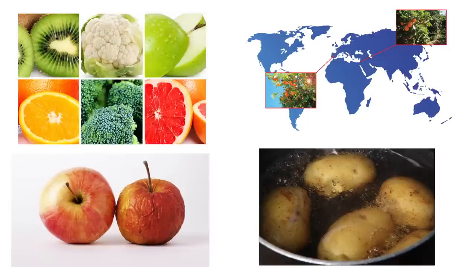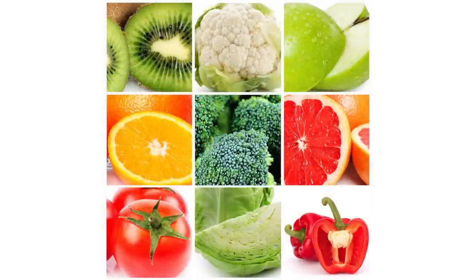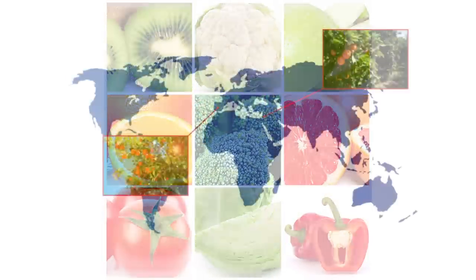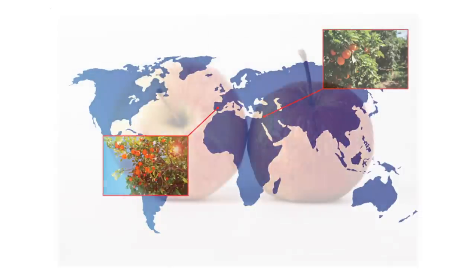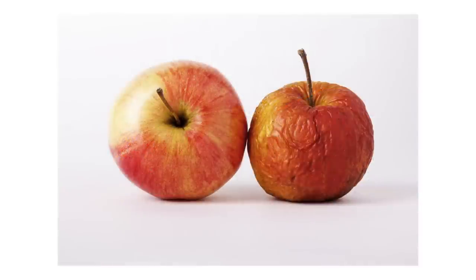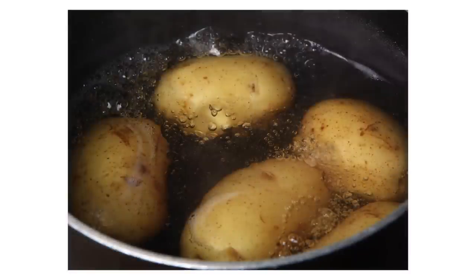So now we're ready to do the experiment, testing the vitamin C in different fruits and vegetables. You'll also need to choose your experiment. There are four choices to the Global Experiment 2013. You can compare between different types of foods. You can test for the levels of vitamin C based on where the foods were grown. You can study the effects of aging the foods, or you can look at the effects of cooking.